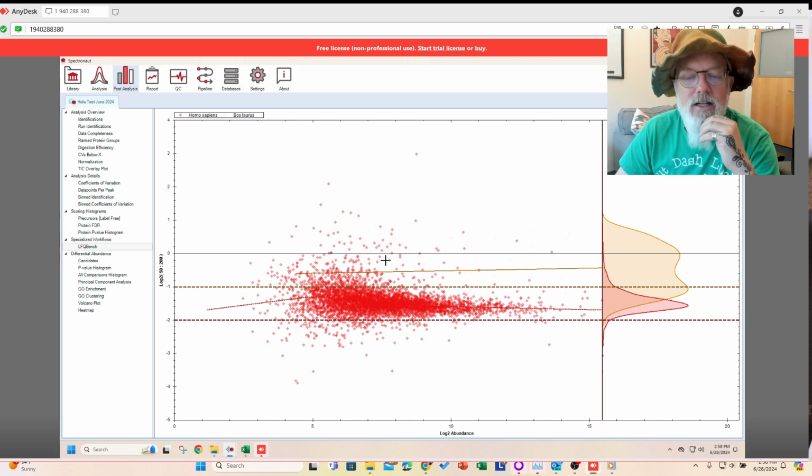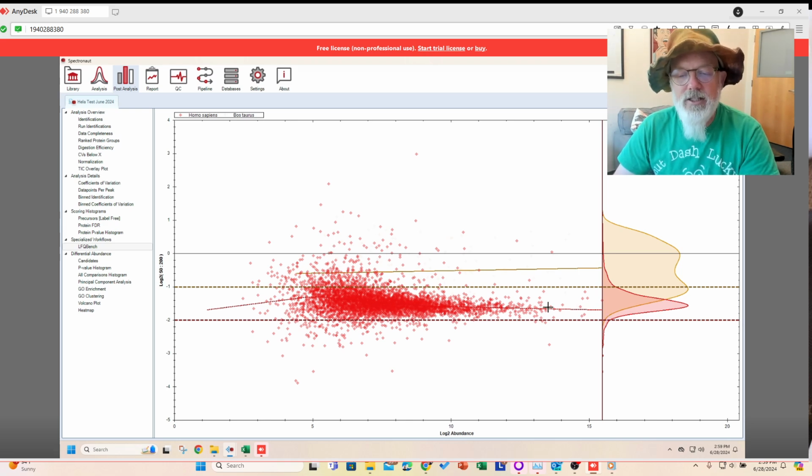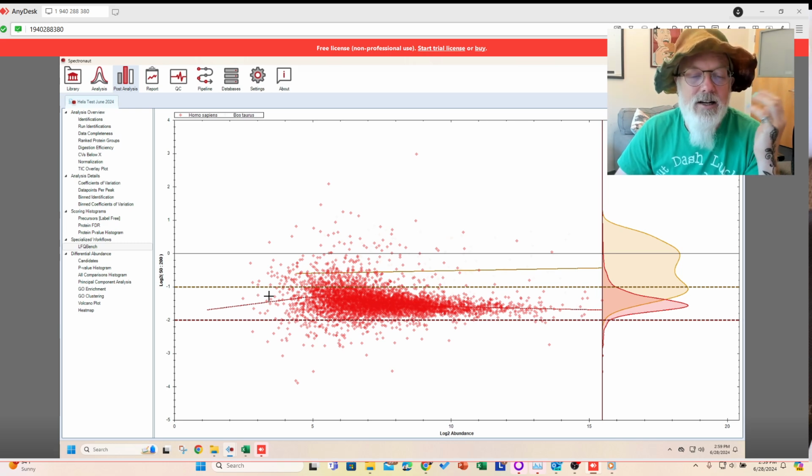Okay, that looks good. And you can see, again, this is like an M over A plot. So as your intensity increases, you expect the quantitation to be better, and that's the intensity of the signal. As the intensity of the signal gets closer to signal to noise, you can see the quantitation's less precise. And you'll see this all the time. So the closer this is to 0, closer this is to 2, this is better. I don't know what this line is here. Must be something.